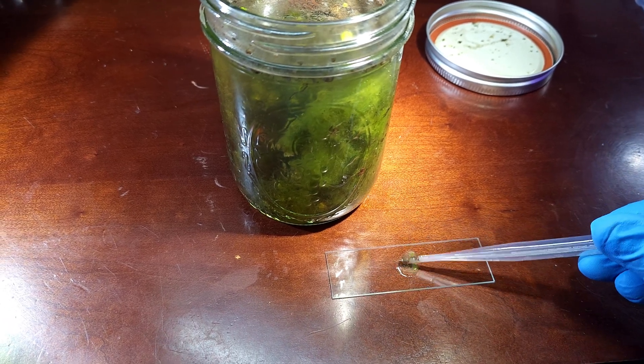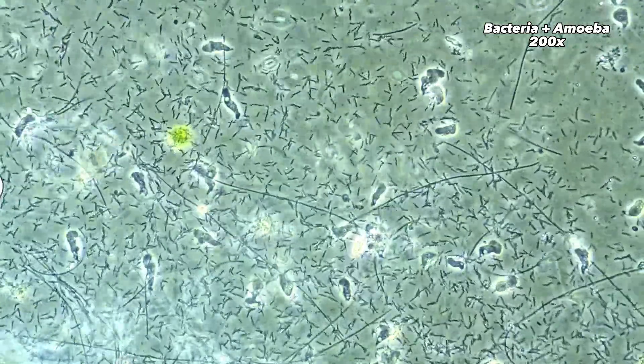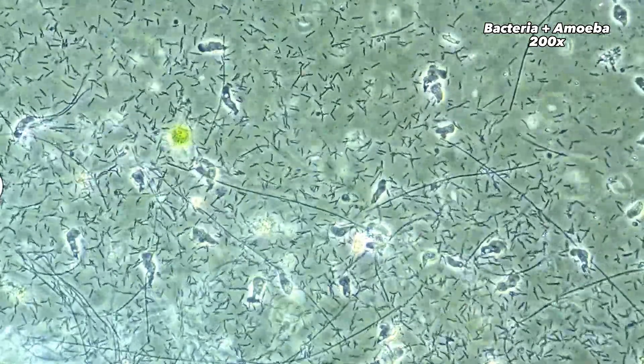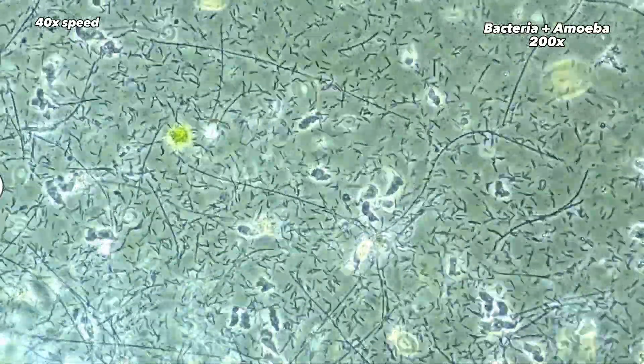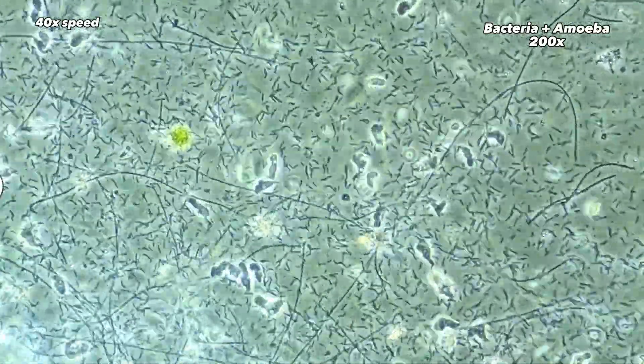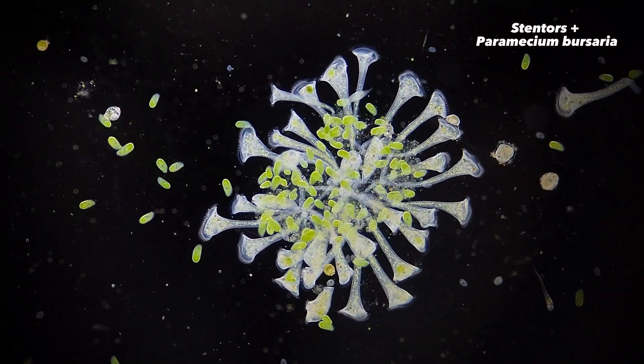The water may also turn a murky white color from all the microorganisms present. If you take a small amount of the stuff on the surface, you should see an incredible amount of bacteria and other cells swimming around. This one had a ton of bacillus, or rod shaped bacteria, along with a few other kinds of ciliates, but it won't always be the same kind of bacteria or organism.